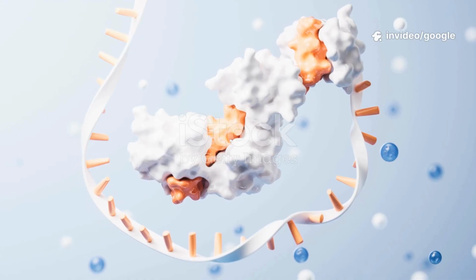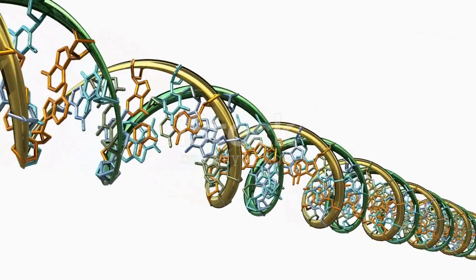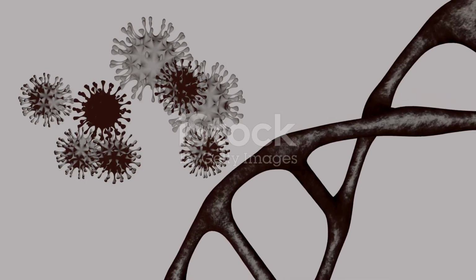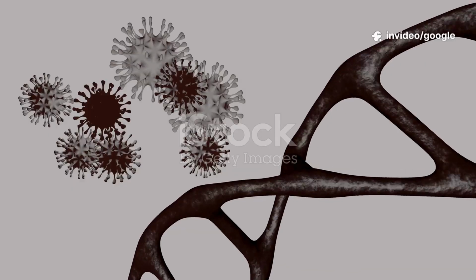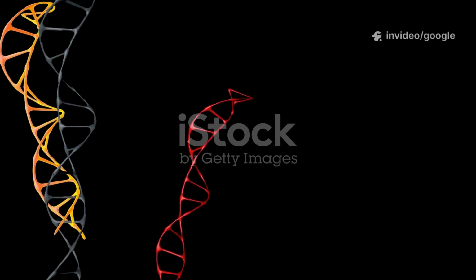Choose gRNA format. Single guide RNA, sgRNA. This is the most common and convenient format, combining the CRISPR RNA and the trans-activating CRISPR RNA into a single, synthetic RNA molecule. A two-part guide RNA system involves separate crRNA and tracrRNA molecules that self-assemble. While effective, it can be less efficient than sgRNA.